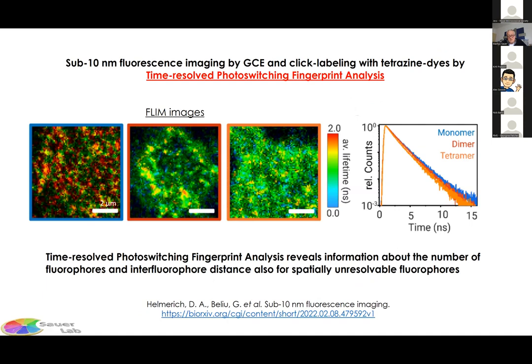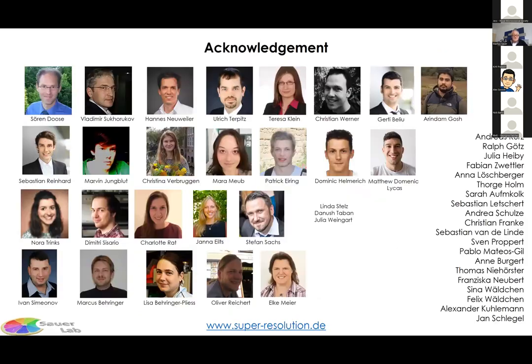This allows you then to reveal information not only about the numbers and inter-fluorophore distance, but also of spatially unresolvable fluorophores. So with that, I'm at the end.